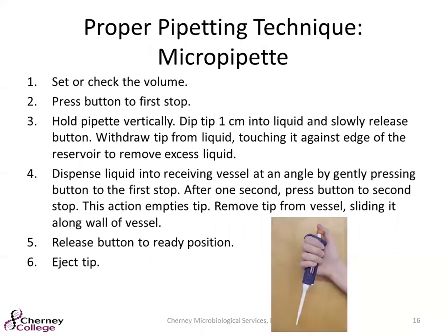So these are the types of pipettes that we use here in-house. Again, whenever you are grabbing a pipette, make sure you check that volume. During the cleaning process, it's very easy for the dispense volume to change.